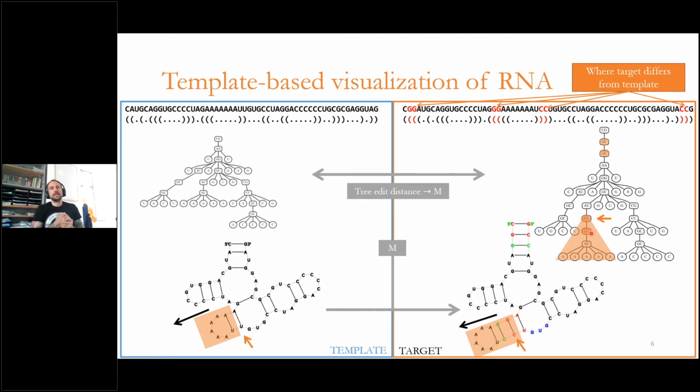Now for different insertions at different positions, or deletions or updates, we do slightly different modifications of the layout, but the idea is still the same. So the tree structure informs the layout modification operation, right? The local topology of the tree determines what layout modification operation needs to be done, and that's the whole thing, right?